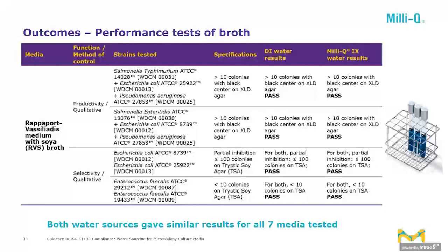Another question that came up is that the amendments to the original standard had some corrections. Are there any noteworthy ones that our audience should be aware of? The corrections were smaller, but affected, for example, the inoculum, the cells to be used for selectivity testing and specificity testing. There were also some corrections for the tests for specific media. So these amendments, especially amendment one with the corrections, should always be used together with the base standard side by side. And amendment two has the tables with the specifications for confirmation, media and reagents, which are also very important in many labs.